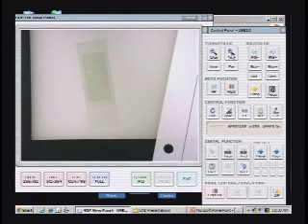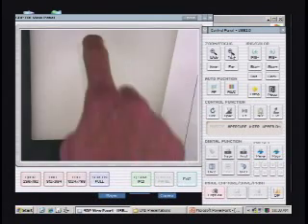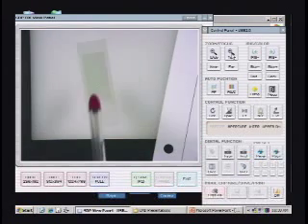Can you notice that there's a kind of a rectangle on the side? There's a film covering the entire slide, but it's glued or adhered to on the edges. And you want your smear in the rectangle. And remember I told you I had these Avery labels.